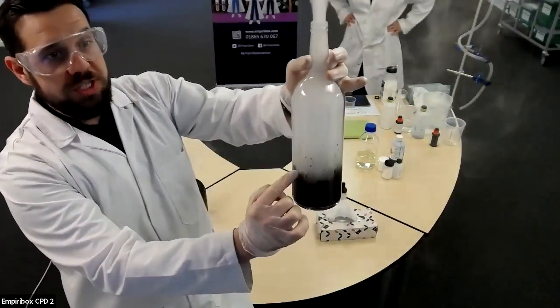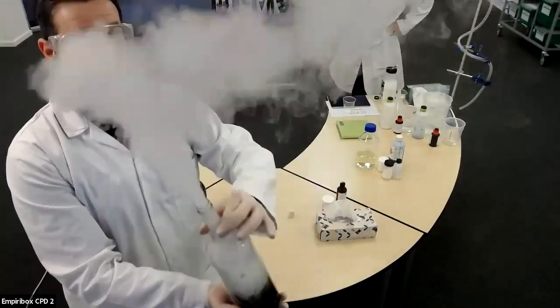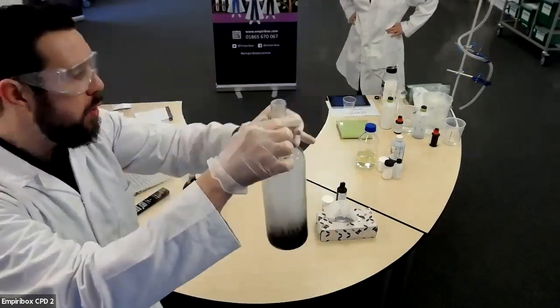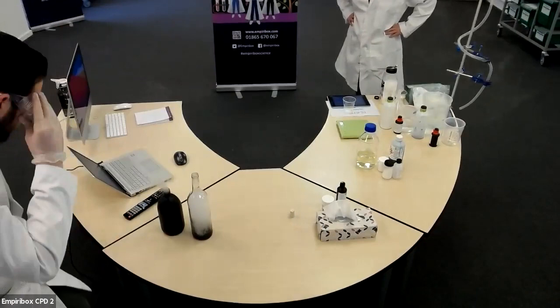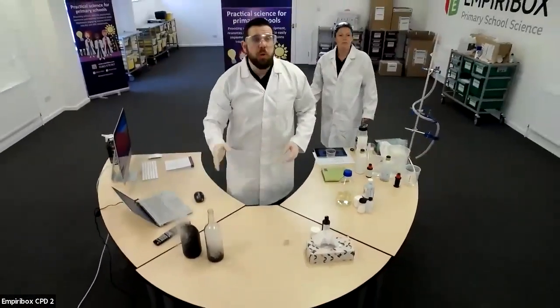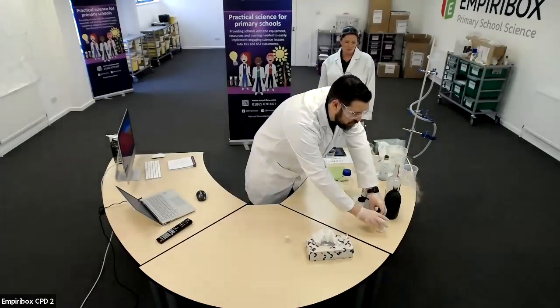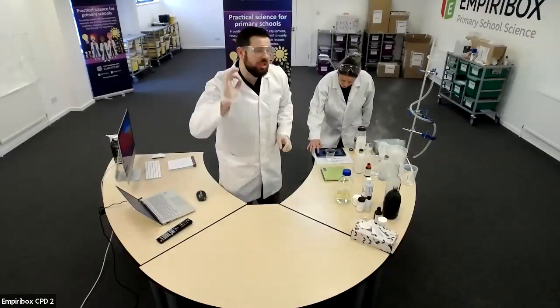Do you also see the bubbling going on at the bottom there? Not only do you see the smoke going everywhere, but this is actually vapor. And you can also see a wonderful color change. Now, I know that in these two, a chemical reaction has taken place. A change has occurred. That means something new was created, a new substance. So that's going to be my first point of call: smoke or vapor is a key indication that something new was created.